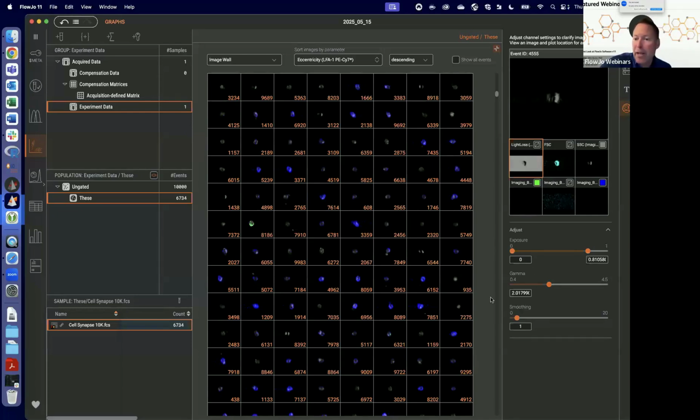And then building controls and images, very much what Chorus is doing, and then start layering the more refined tools.